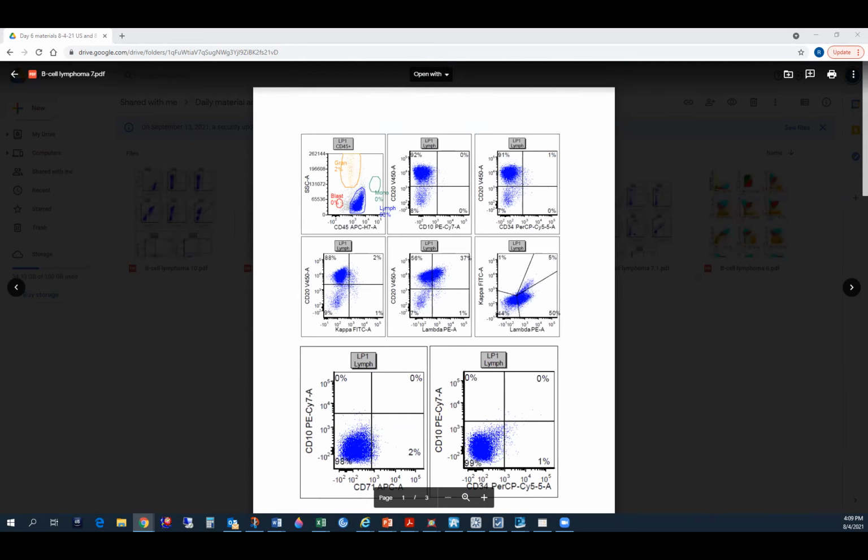No problem. Carry on. Okay, so this one was a classic case to me for hairy cell. On this one, we are targeting the blue population, which for CD20 is kind of moderate. I'm used to seeing it a little brighter for hairy cell, but it is CD20 positive, CD34 negative.